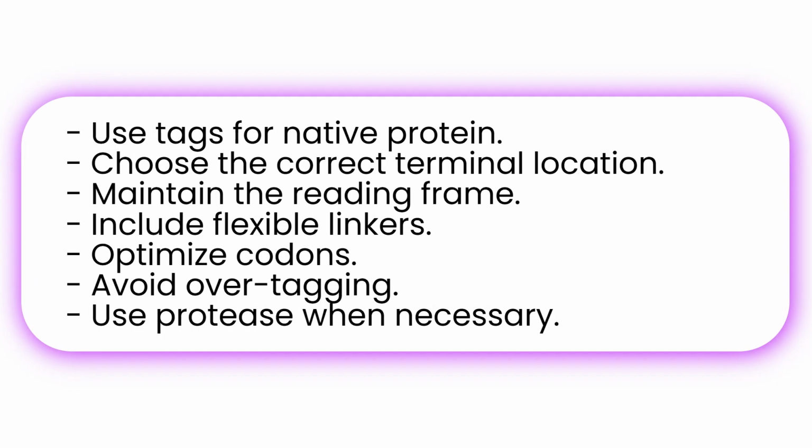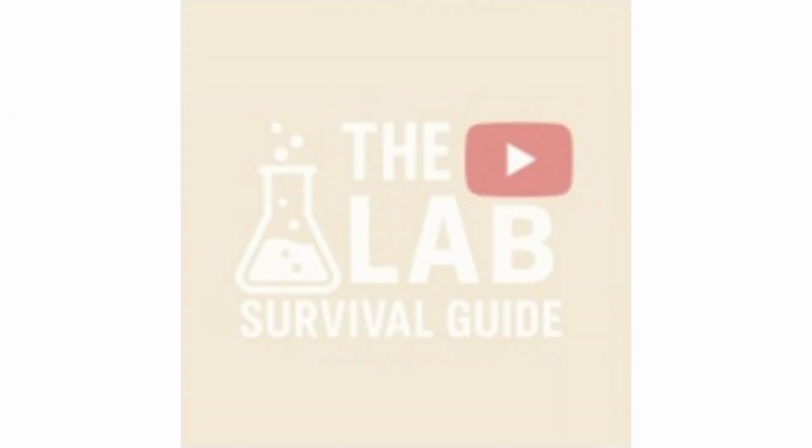Recap. Protein tags are powerful tools when specific reagents are unavailable. Choose the correct terminal location. Maintain the reading frame. Include flexible linkers. Optimize codons. Avoid overtagging. Use protease sites when necessary. Design carefully, and your tag will work for you, not against you.